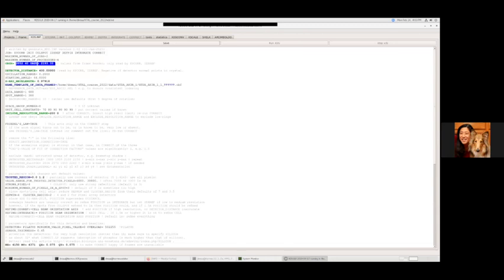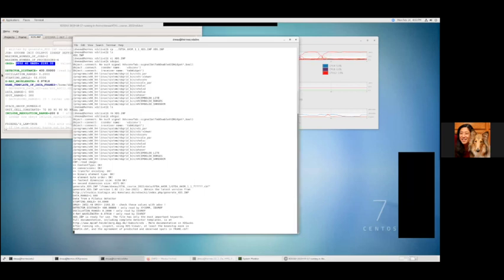Hey, David, can you more a header and just show them what our headers look like? Can I more a header? Yeah, that's how I always look at headers. I just more them. I more the file.